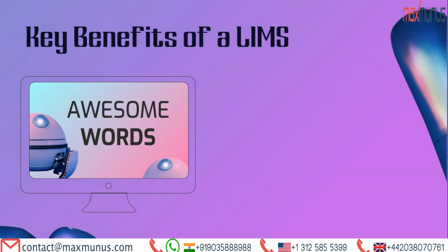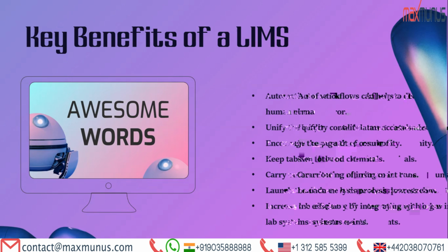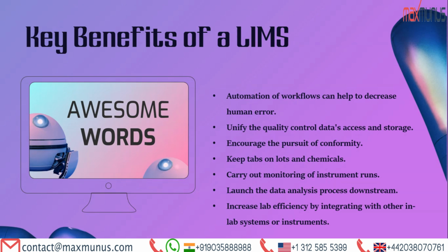And next we have the key benefits of a LIMS. Automation of workflows can help to decrease human error. Unify the quality control data, access and storage. Encourage the pursuit of conformity.